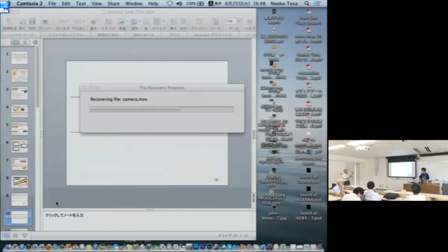I heard that Kusafuka-san measured the onion epidermal tissue by drying it one night in a 40-degree oven. Yes. So I need to find a suitable condition for drying.